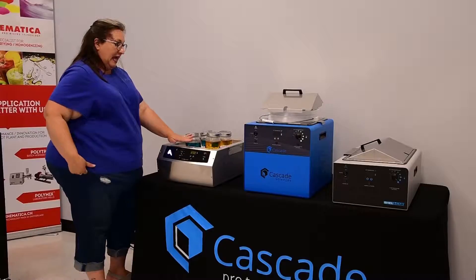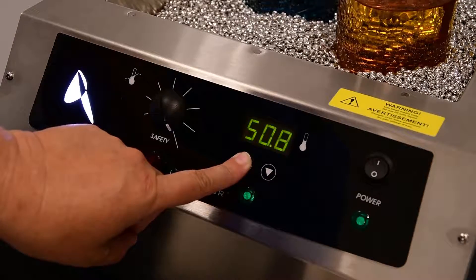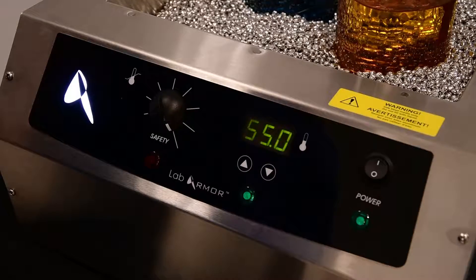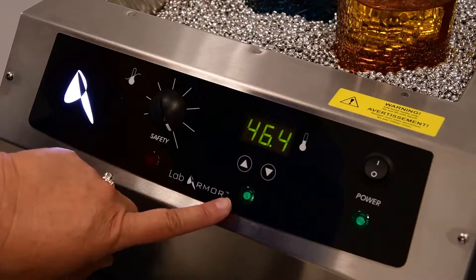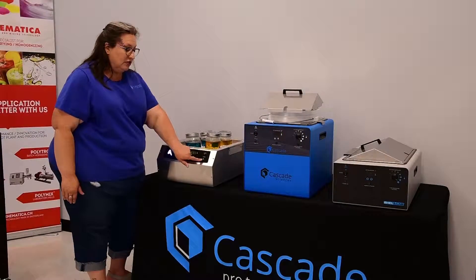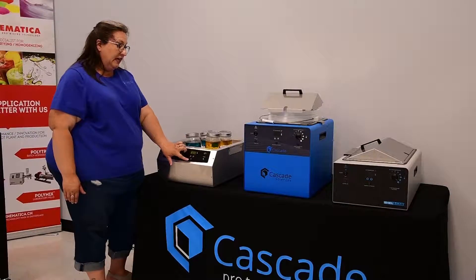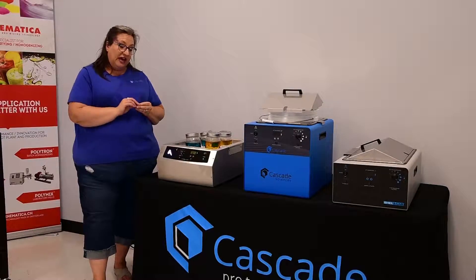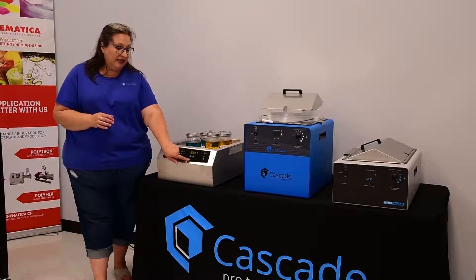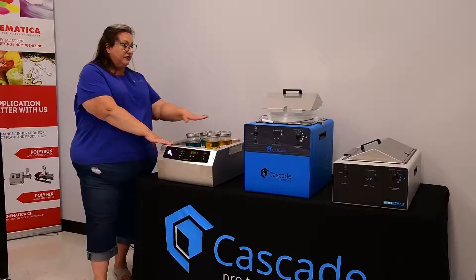Looking at the control panel, I have this bath set right now and it's gone up to its set point. You can push either of the up or down arrows — it'll flash SP for set point and then flash your set point. While it's flashing you're able to adjust the set point up or down. It flashes for a minute to verify that that's your number, and then once it's on it shows you the actual process temperature. The pilot light under the power switch is always on when this is engaged. The heating light is not always engaged — it's very smart. When the heaters are activated it'll flash. Right now the set point is equal to the process temperature in the bath, so this little pilot light is blinking very nominally, just small little blinks, which shows you that the controller is pulsing heat into the bath to maintain the temperature.